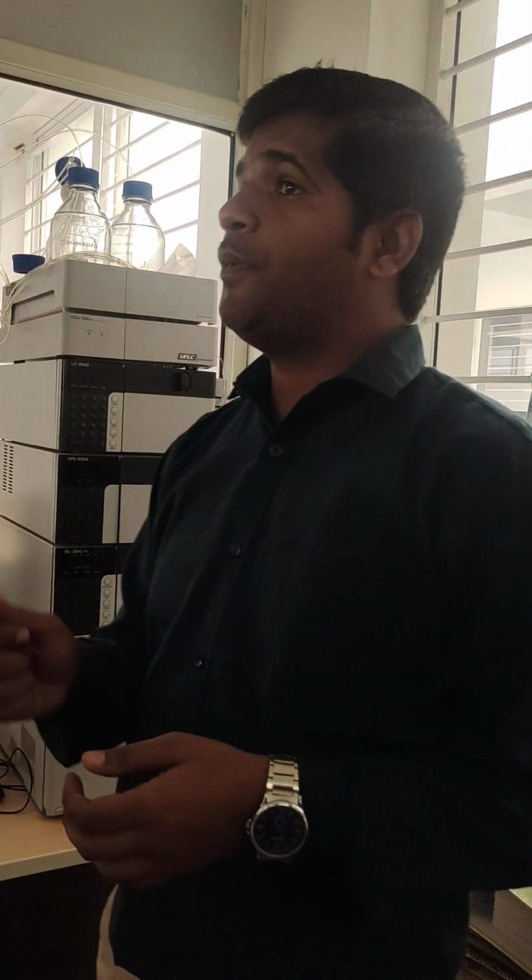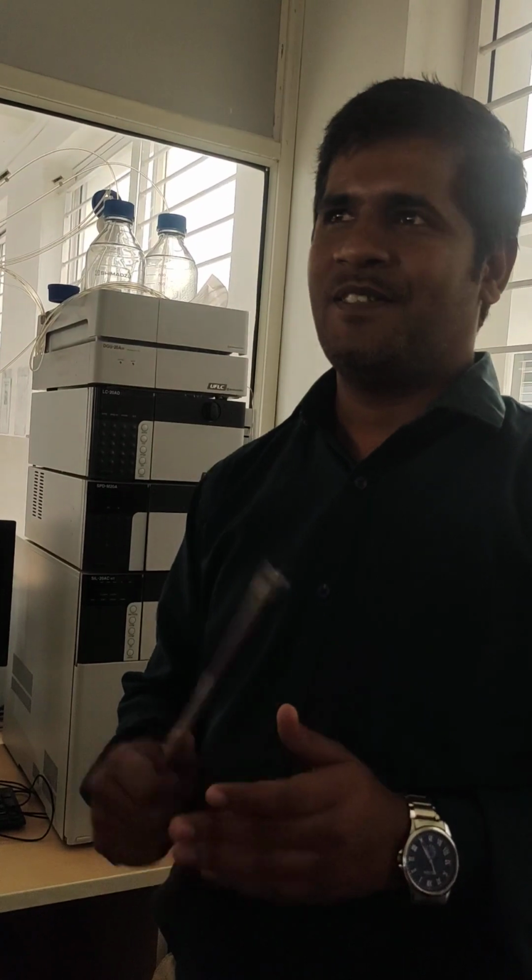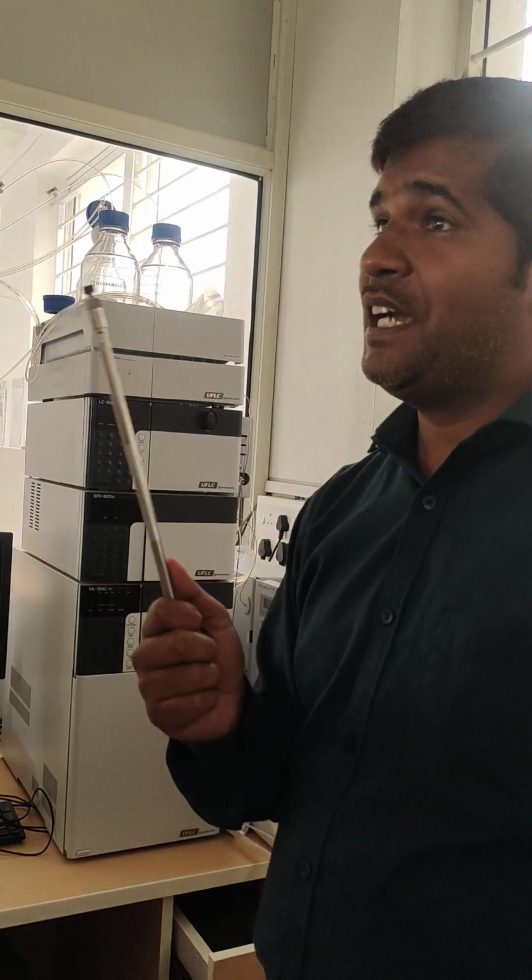Even hydrophilic compounds can also be analyzed with this. We just change the mobile phase and we get the analysis. If you want to analyze a hydrophilic compound also, the C18 column has versatile or limitless uses. That's why we have two columns which are C18.